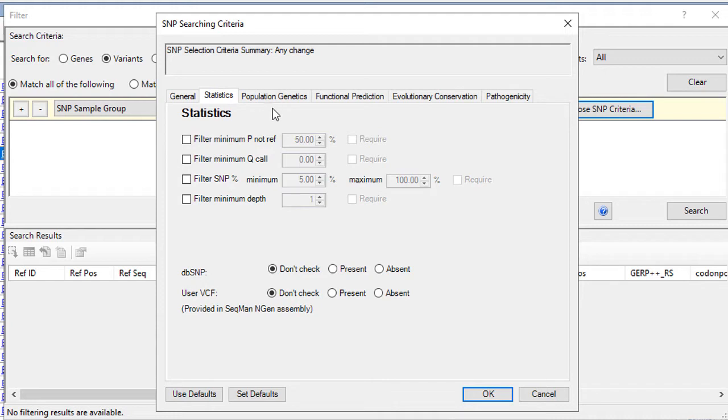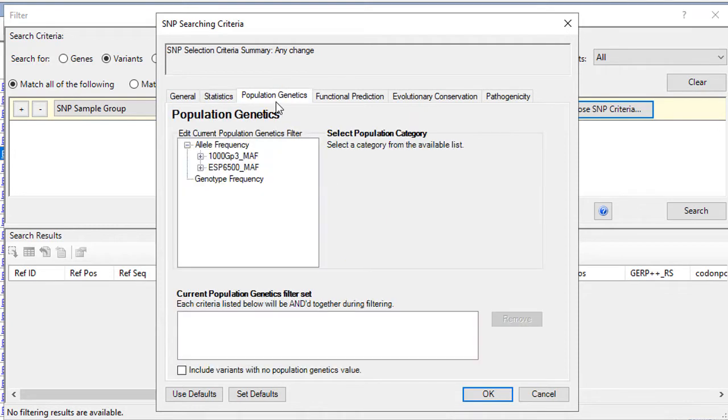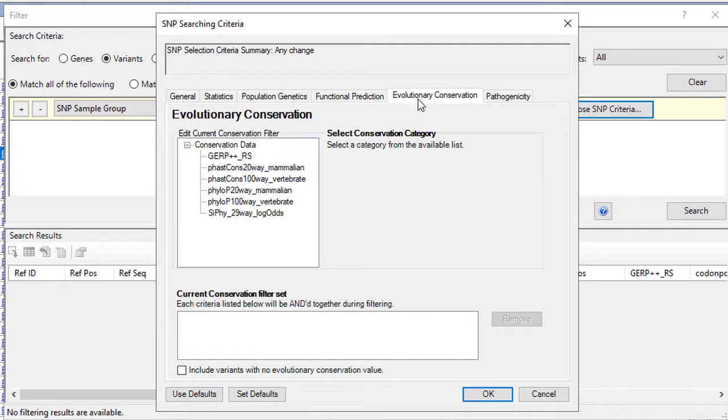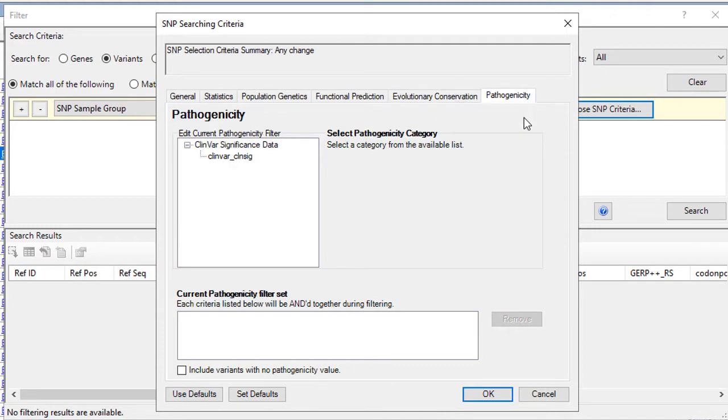and multiple databases and prediction methods from dbNSFP, including population genetics, functional predictions, evolutionary information, and pathogenicity information.